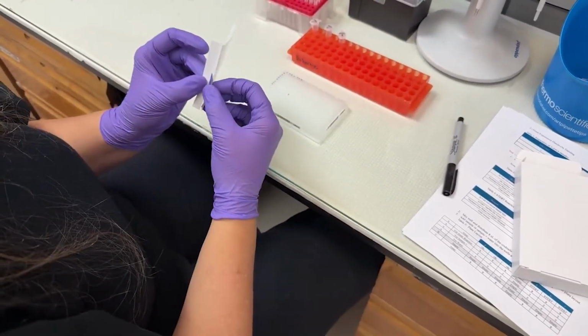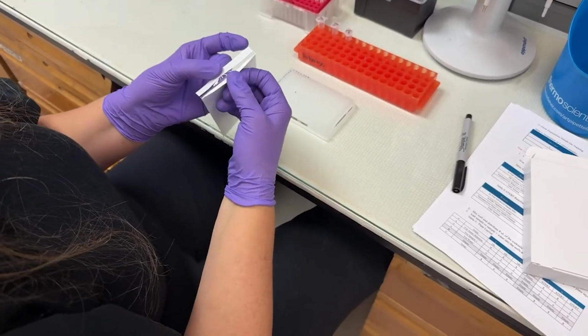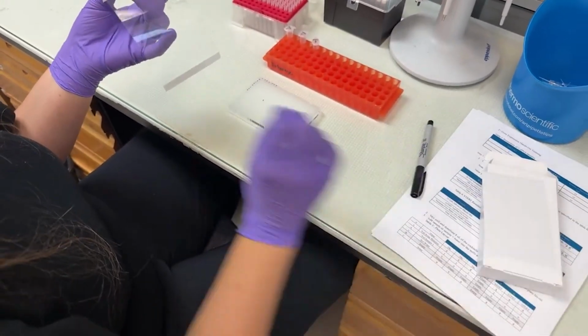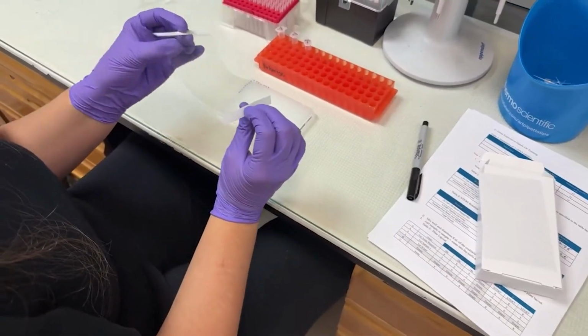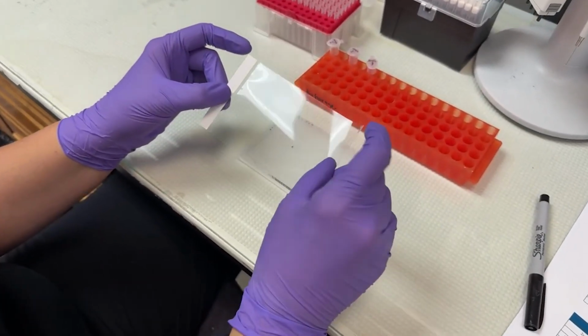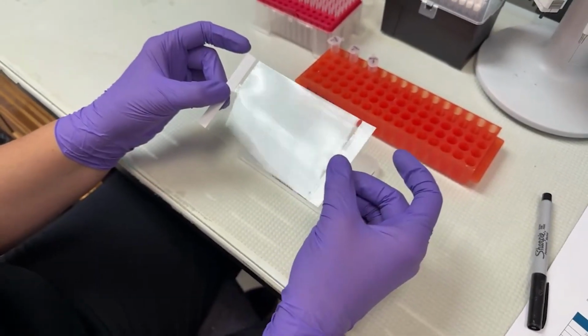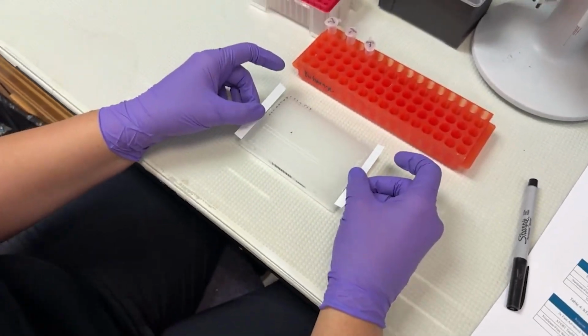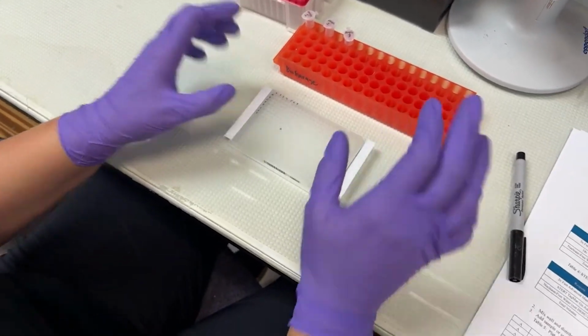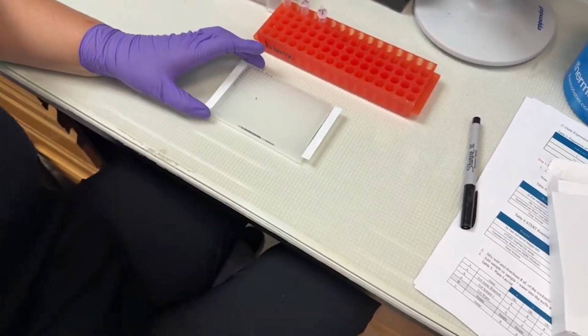So if I separate this, I can take off the backing. I'm going to hold on to these end tabs. And it's going to be kind of hard to see, but each one of those, right where it's perforated. So what I'm going to do is line that up as best I can. It's not worth getting really stressed out about.